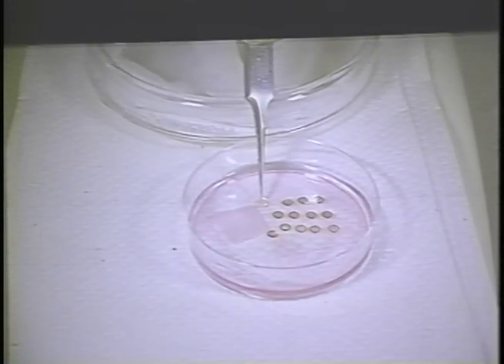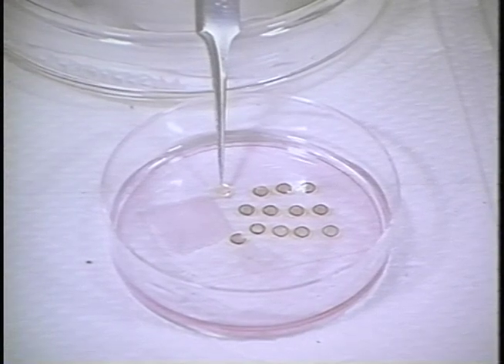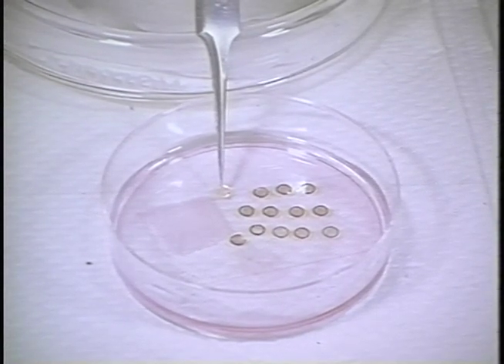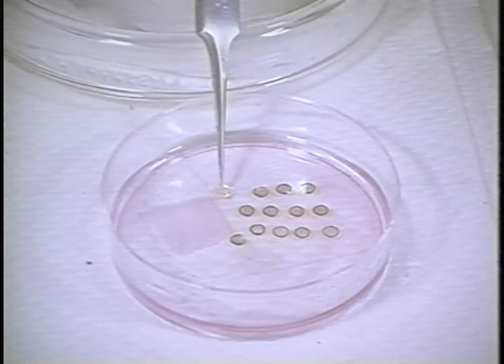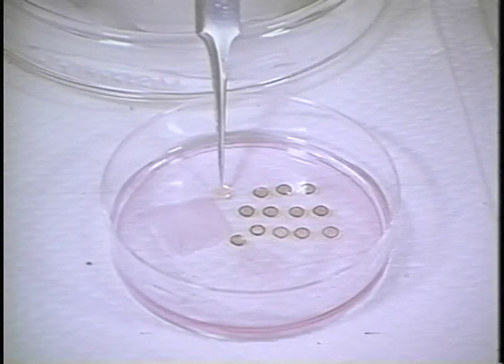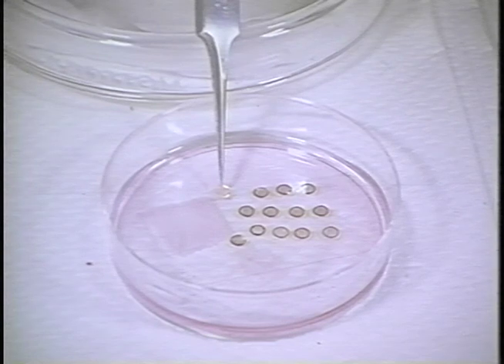I use the plunge freezing method to cryofix monolayers of cultured cells for either freeze substitution analysis or for directly imaging frozen cells in the cryomicroscope. I use PTK cells, that's the cell type I'll be talking about today, which is a mammalian epithelial cell line. They're grown onto carbon-coated, Formvar-coated, carbon-stabilized gold grids. Next slide.